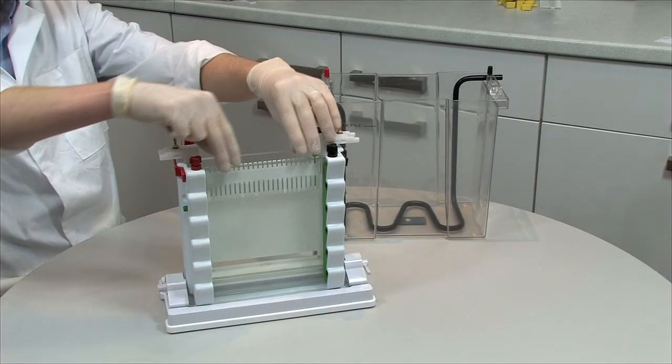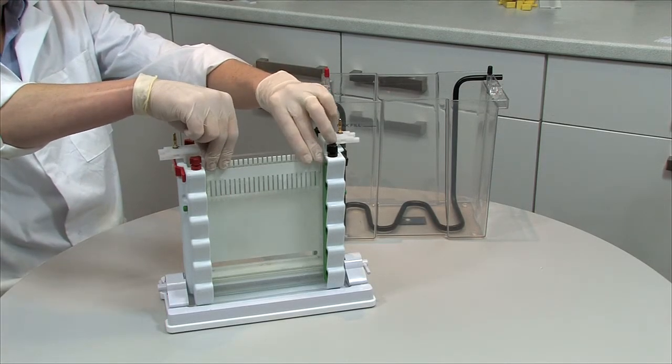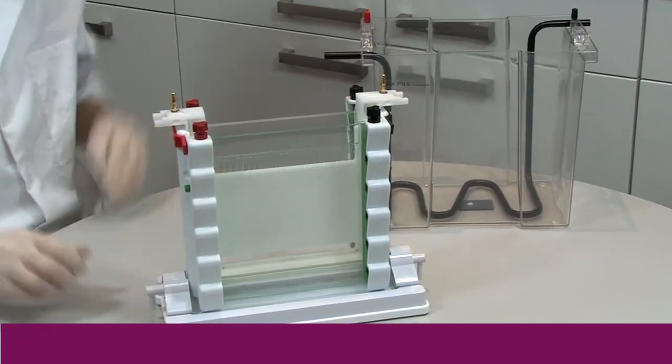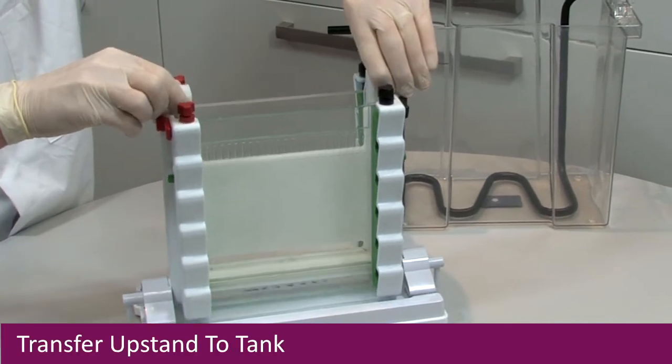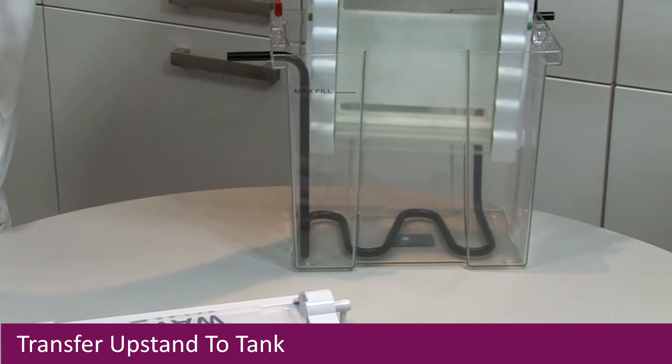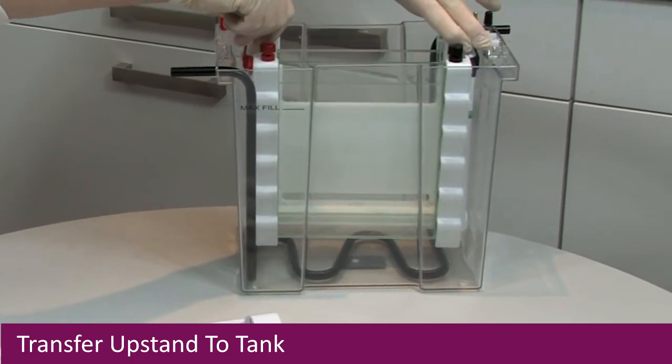Remove the combs from the polymerized gels. Align colour coded screws with red and black thumb locators in the tank. If connecting to a chiller, make sure that the cooling coil is in situ before inserting the upstand.